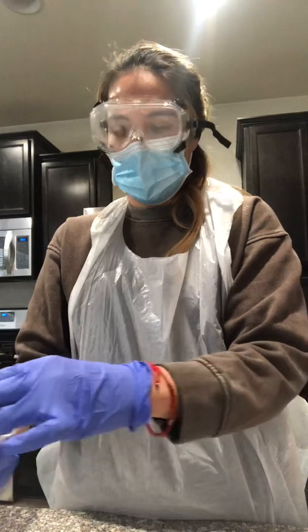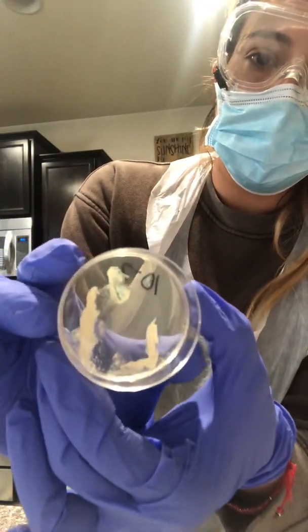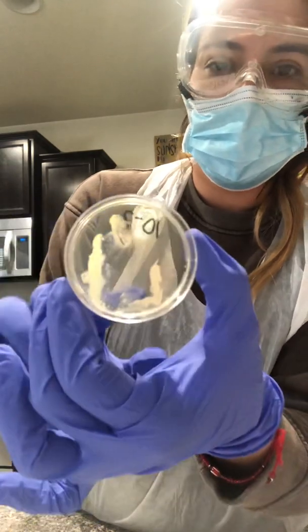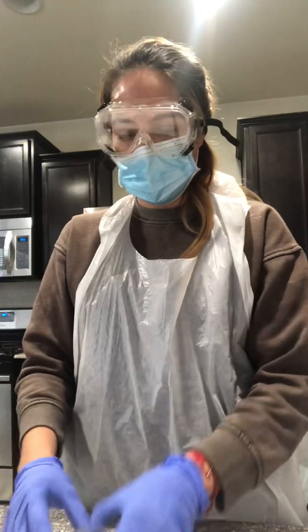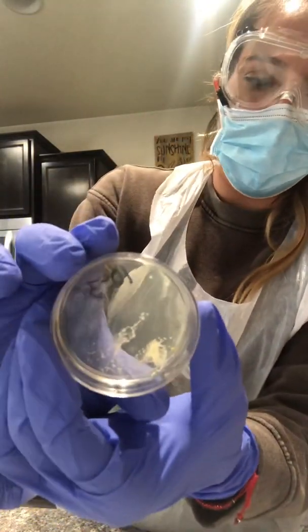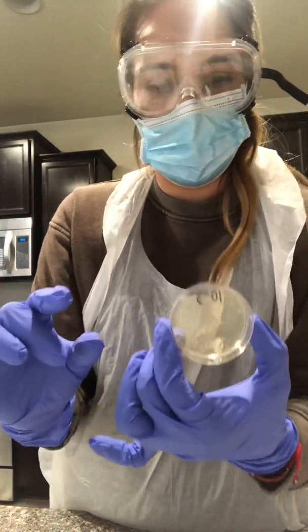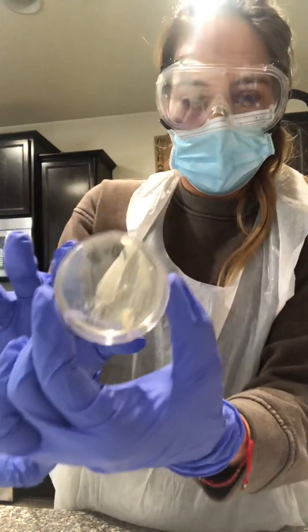And for the Agar plate number 2, this also grew a little amount, and it's also light in color. You can see it right here. To me it looks flat. And for the Agar plate 3, it looks smaller. It's more on the outer of the plate, and that's where you see the most colonies, on the outer side of the plate.